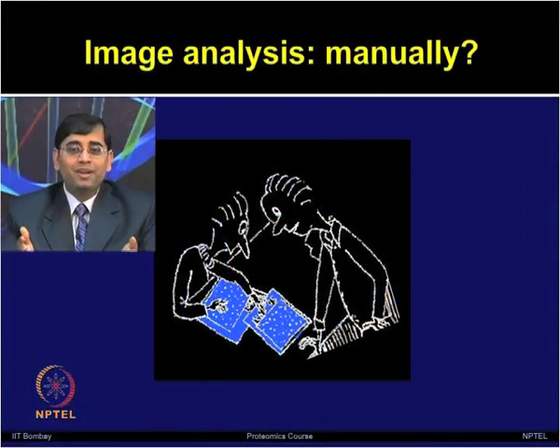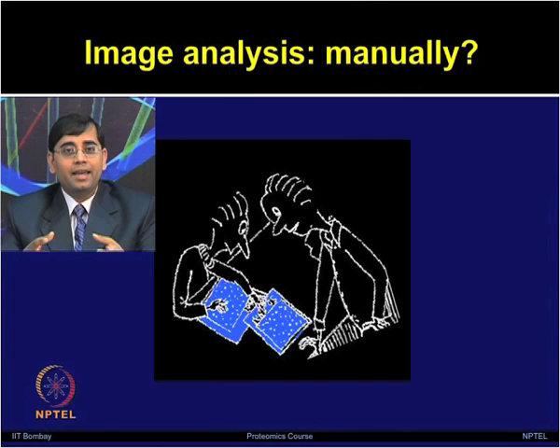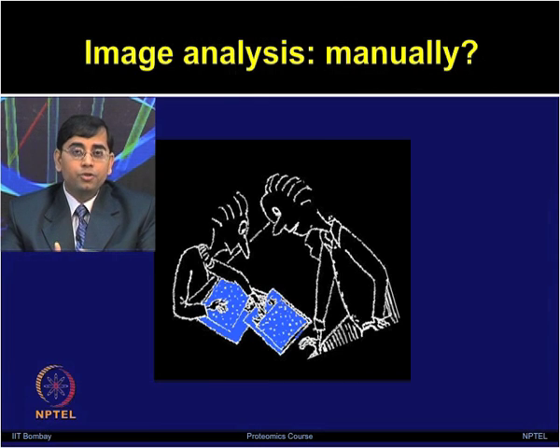That is going to be very tedious work, and you will not have any information about whether your spots have any statistical significance or not, how reproducible those are. So, you need to scan it using good scanners, and then finally, you need to analyze your image with the different softwares which are available.